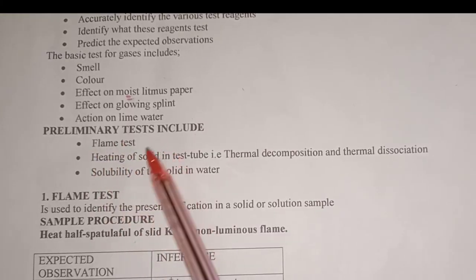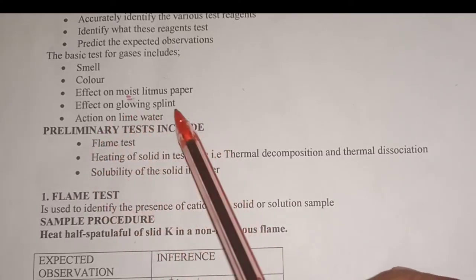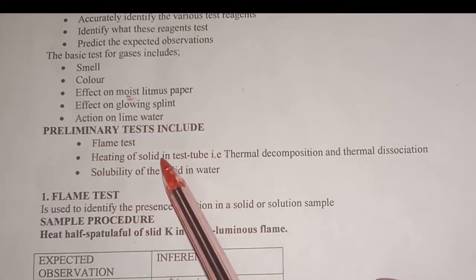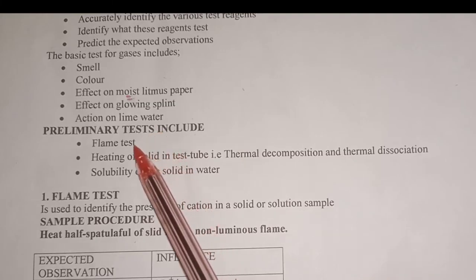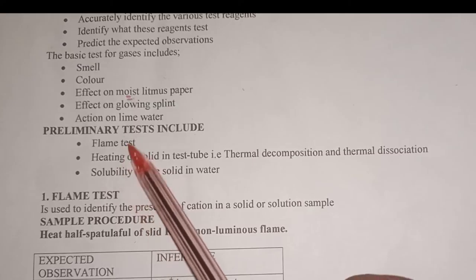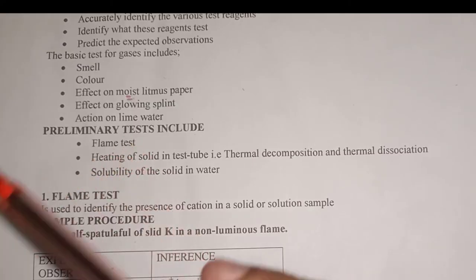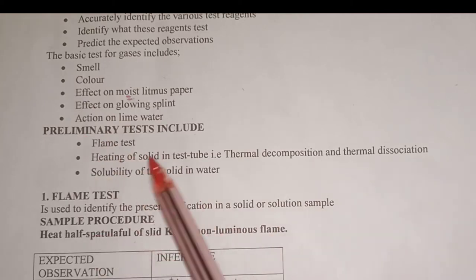Preliminary test means you cannot identify or confirm the presence of a certain cation or anion in a sample by using this preliminary test. This one just gives you a basic foundation of the tests that you are going to carry out.